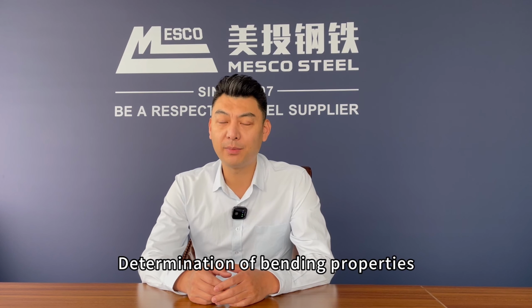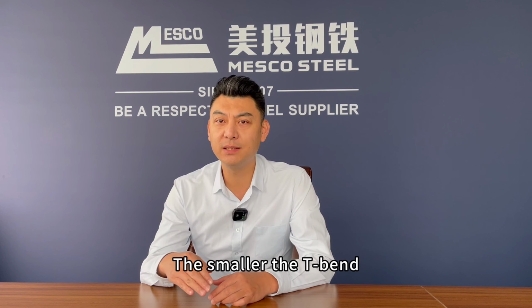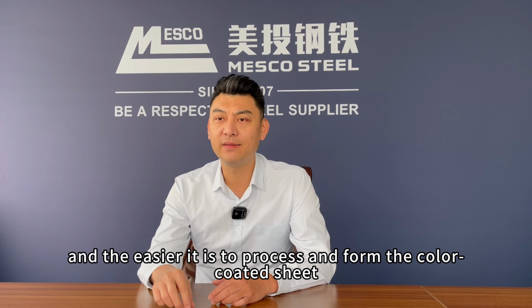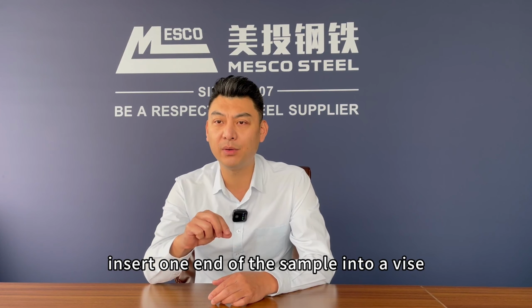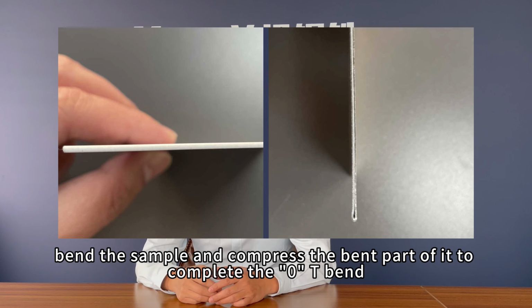Determination of bending properties. Bending performance is an important indicator for evaluating the flexibility of paint coatings. The smaller the T-bend, the better the flexibility of the coating, and the easier it is to process and form the color-coated sheet. Use a bending testing machine, insert one end of the sample into a vise, bend the sample, and compress the bent part of it to complete the 0 T-bend.